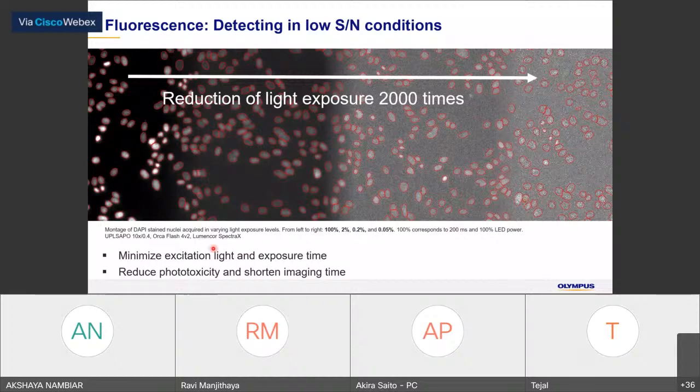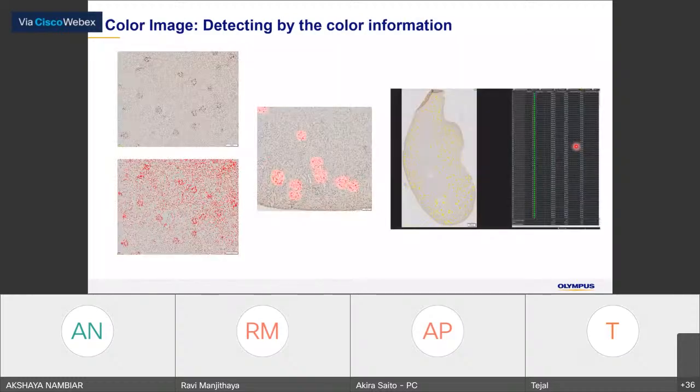So you can see that this one is very easy to identify. This one is quite difficult, but even in this condition, we can still segment the nucleus very well. And of course, this is not only for a single image. You can use it for a very big stitched image as well.